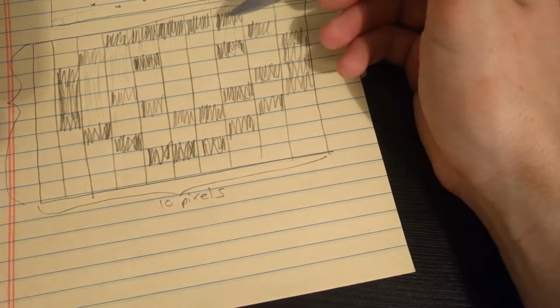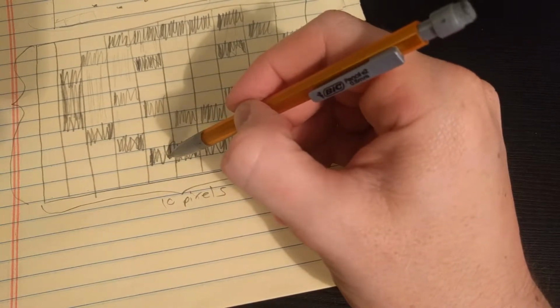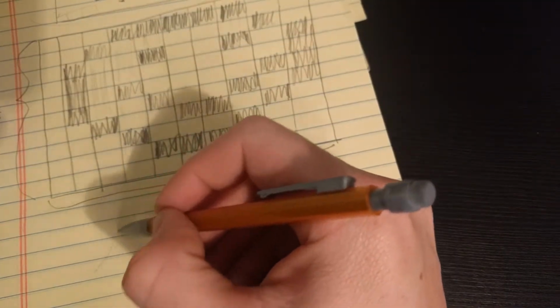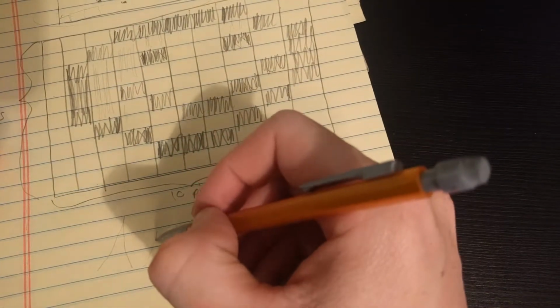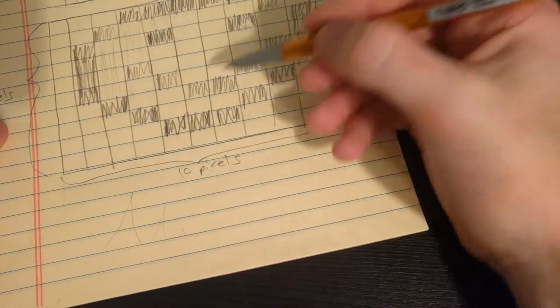And of course, there's details I'm ignoring, such as the resolution. For instance, you're not going to have a really high peak here and then move a little bit and then have 0 peak. You're going to have a high peak on 1 pixel, and then you're going to move the laser spot a little bit, and the peak's going to go down a little bit, and again. It's going to approach 0.